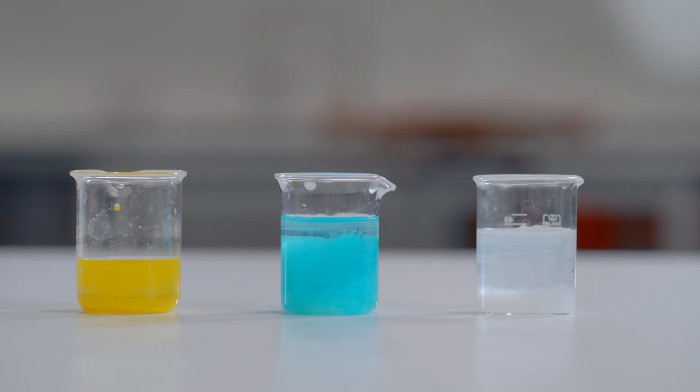So there we go. We got 3 examples of precipitation reactions. We could see that on each occasion there, we actually formed a cloudy-like substance when you've mixed 2 aqueous solutions together. Usually the starting solutions are completely transparent and you tend to form, in most cases, a white cloud. However, if you're lucky, with a transition metal present perhaps, you might get these beautiful colors as well.